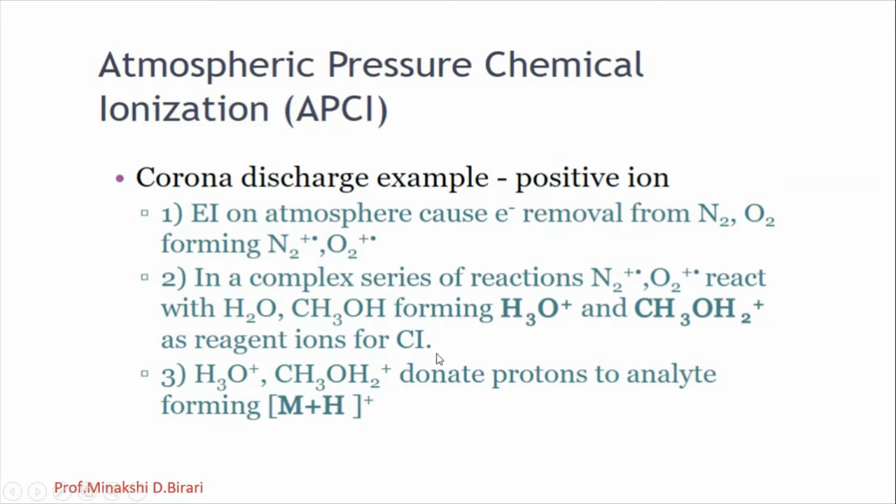Sometimes analyte vapors may also be ionized by the electrode, and a corona discharge electrode or emitted beta particles are used for ionization. Due to the collision of ions and molecules, charge transfer takes place between the solvent and analyte, so that there is the production of MH+ ions, which are called quasi-molecular ions.